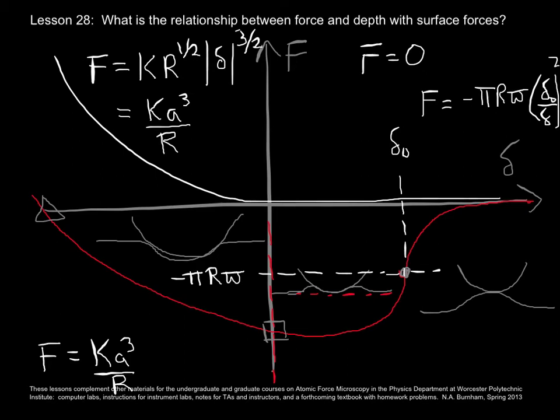And so that will be our third term in our equation that we're building here at the bottom. And what's interesting is the term that we're going to put in the middle. The term in the middle has to account for how attractive forces continue to grow after the first atoms on the tip and the sample have already started to touch.